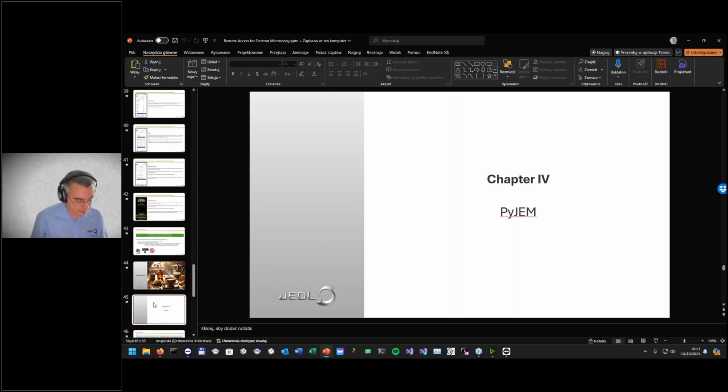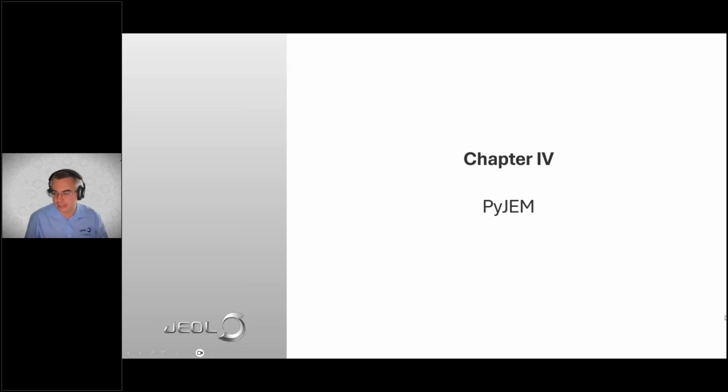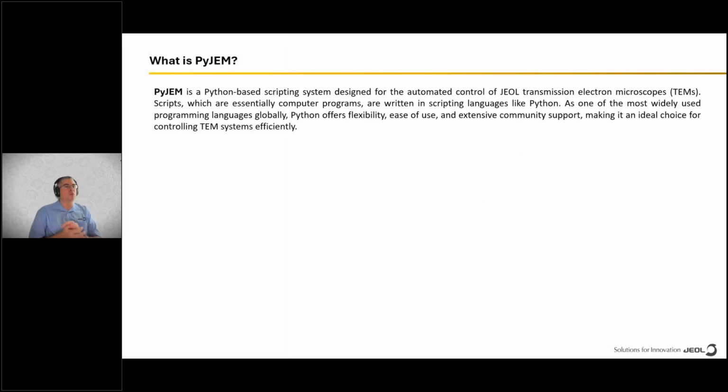Right. So let's resume with the next chapter, the last chapter planned for today, and this is entitled PyJEM. So what is PyJEM and why we should care about it? PyJEM is a module that can be used with the Python programming language.